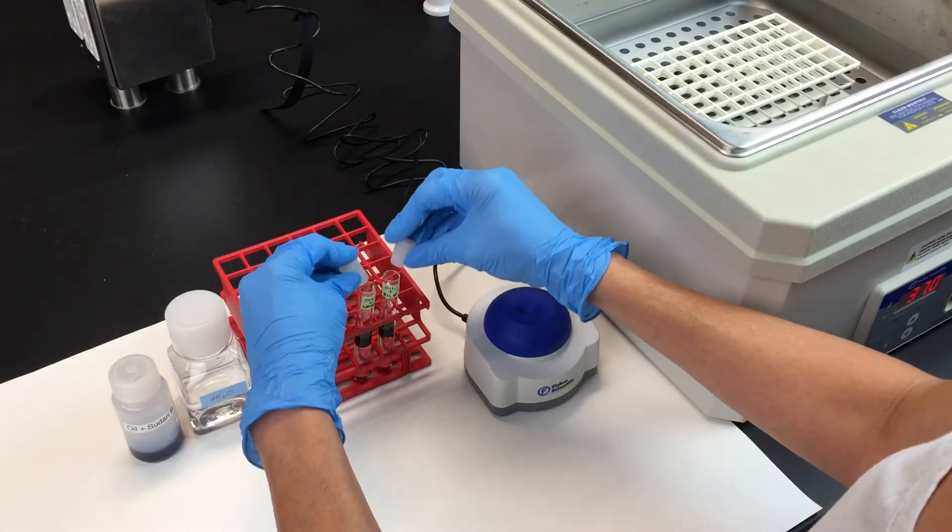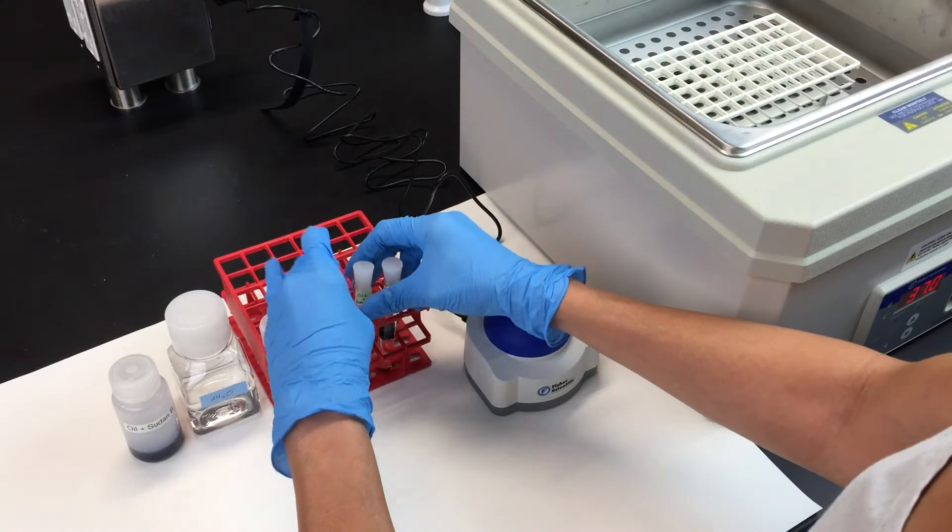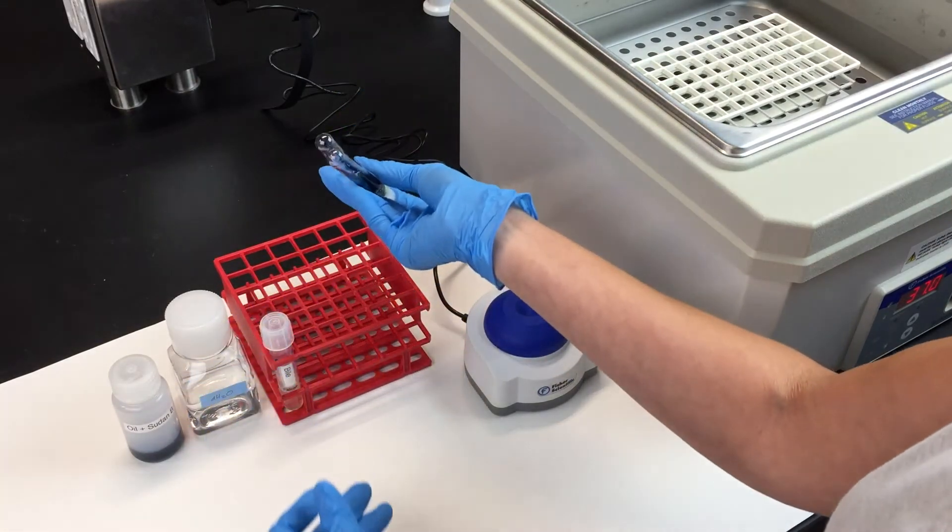Put a stopper in each tube and carefully invert each one. Note how the oil drops form and rejoin into an oil layer on top of the water or bile.